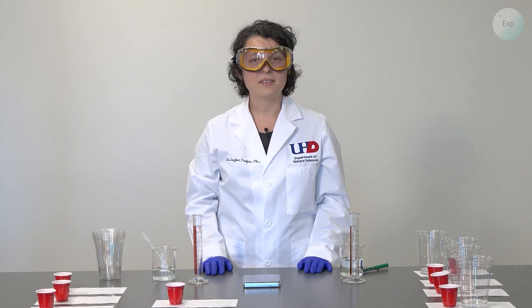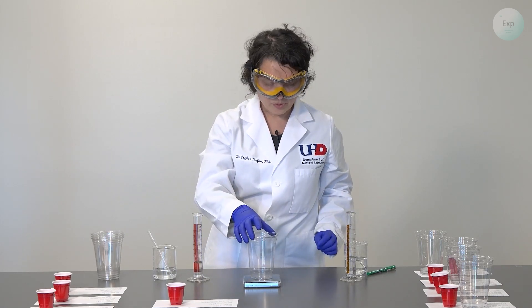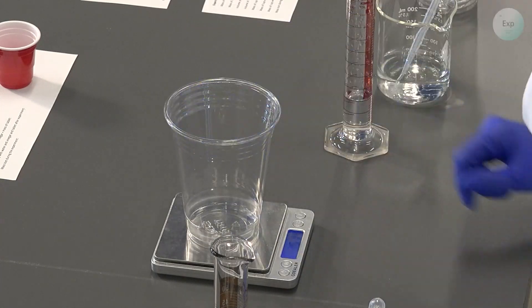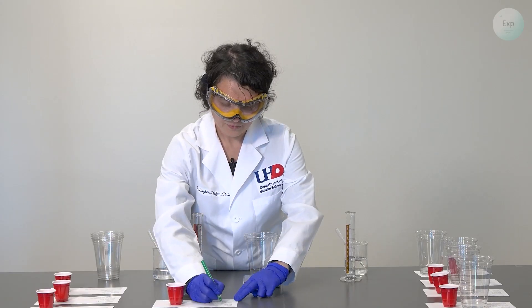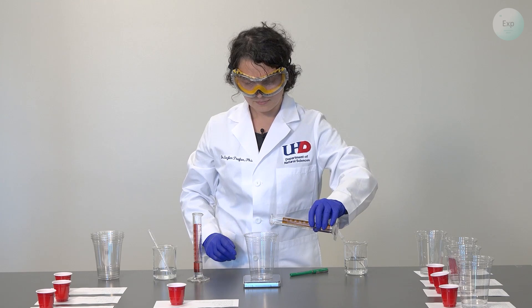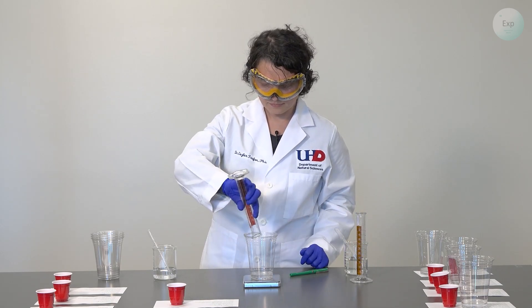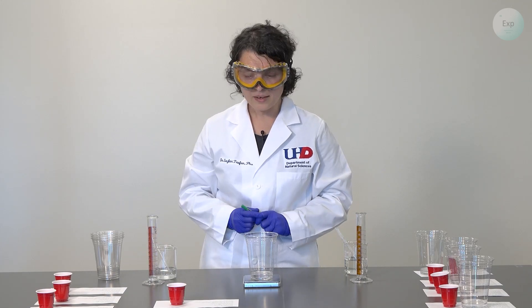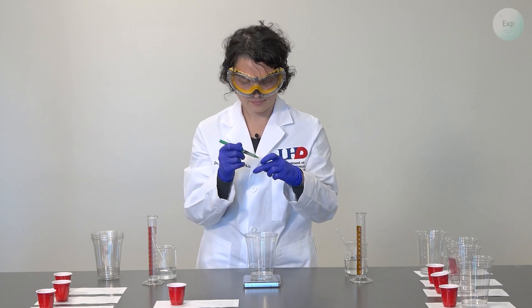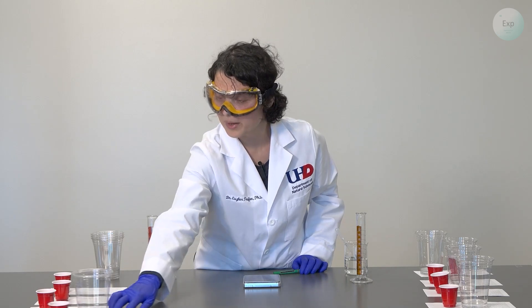For experiment number five, we're going to use 20 milliliters of vinegar and 15 milliliters of water. Once we have our appropriate volumes, we make sure our scale is at 0.00, place our cup on top of it, and record the mass of the cup: 15.13 grams. Then we transfer our vinegar and our water, and record the combined weight: 47.97 grams. Once done, we place the swirled, now homogenized solution onto the paper and slide it back.